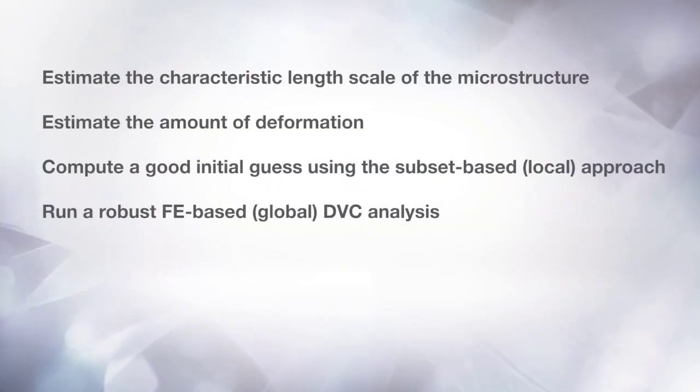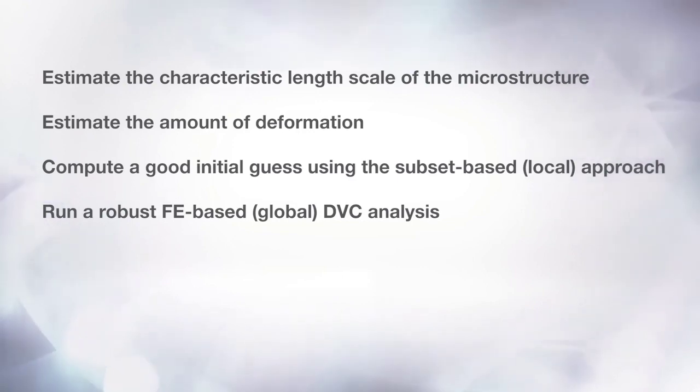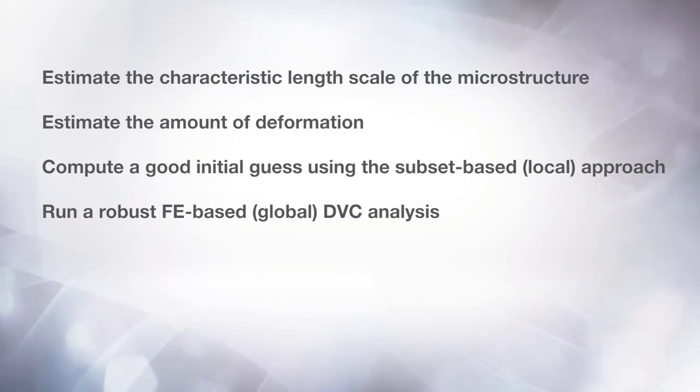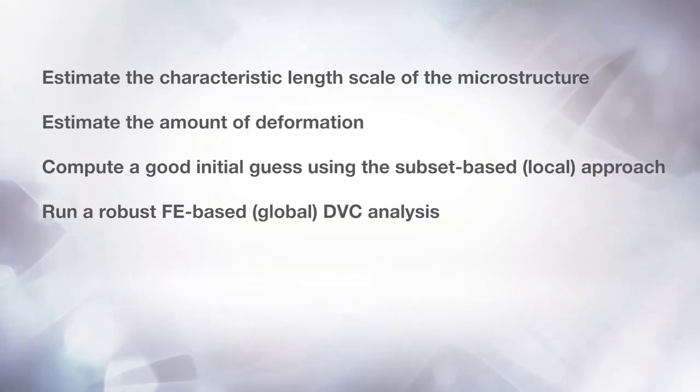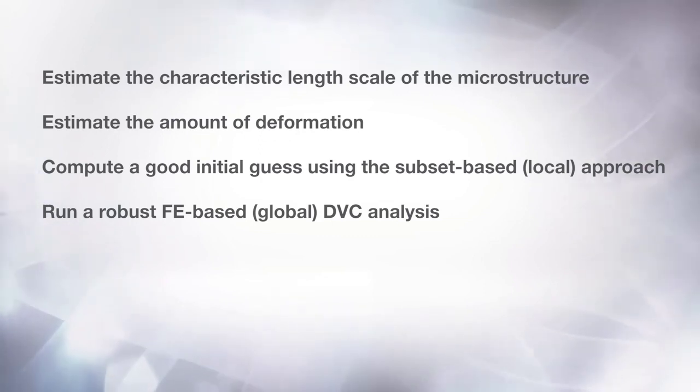First, you will learn how to estimate the characteristic length of the microstructure, as well as the amount of deformation in a series of images prior to performing a DVC analysis. Then you will learn how to use the two approaches to DVC included in the Digital Volume Correlation module, and how to visualize the results of the computation.